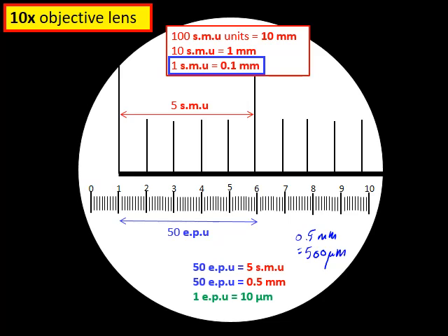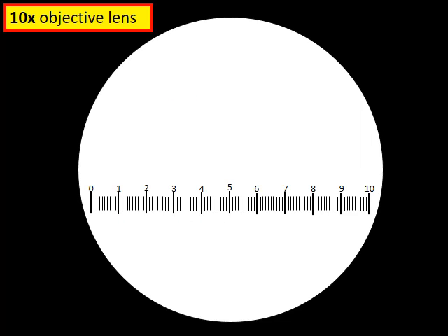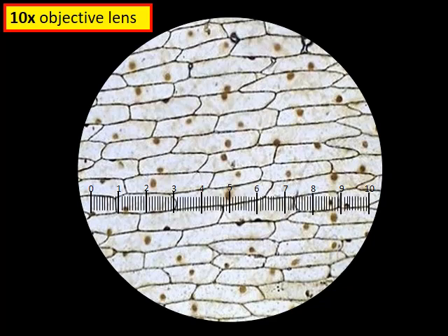This value of 10 micrometers per eyepiece unit is two and a half times less than the 25 micrometers calibrated for the four times objective lens, which makes sense. We remove the stage micrometer from beneath the ten times objective and place the same onion cell slide back on the stage. The cells now appear two and a half times more magnified than before.